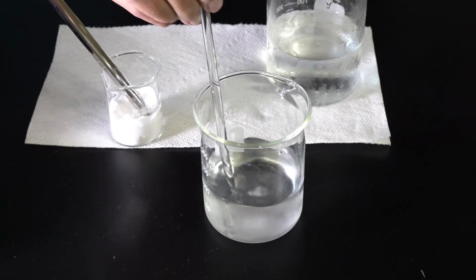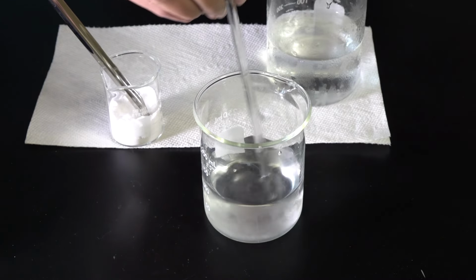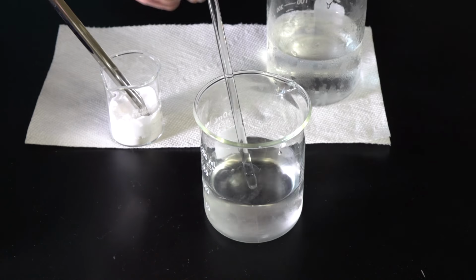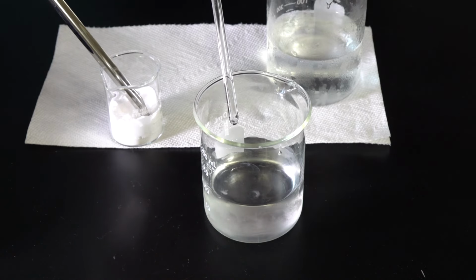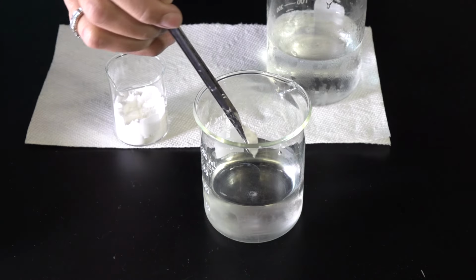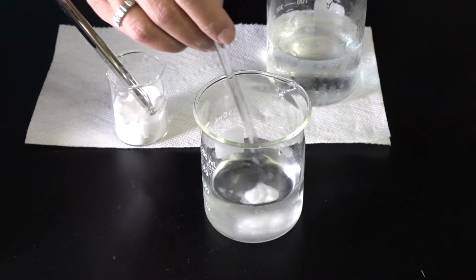Here I see that despite stirring, powder remains on the bottom of the beaker. So I'm going to give it one more good stir there. Most of that's gone. I'm going to add one more scoop and keep stirring.